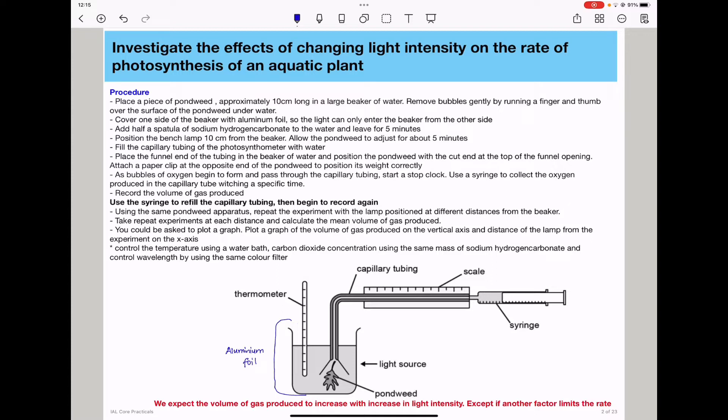We will then cut the Canadian pondweed plant. In some experiments, they cut it underwater in order to prevent bubbles from forming at this position here. You do not want bubbles of gas to be trapped there. However, in this description, I have talked about the idea of cutting it and then rubbing it with your fingers in order to prevent or remove any bubbles that could have formed.